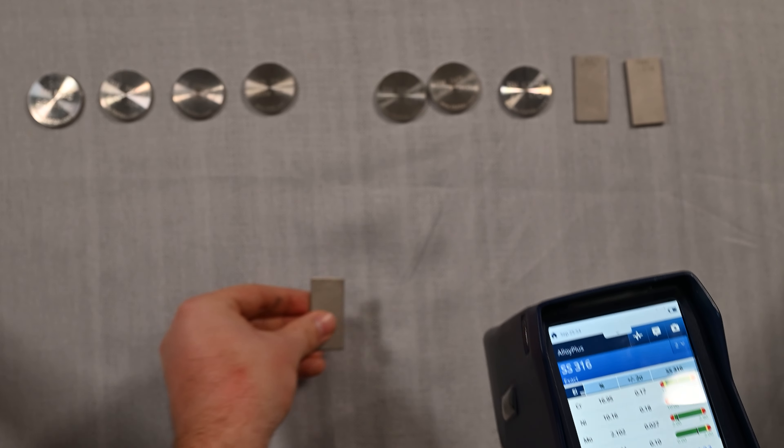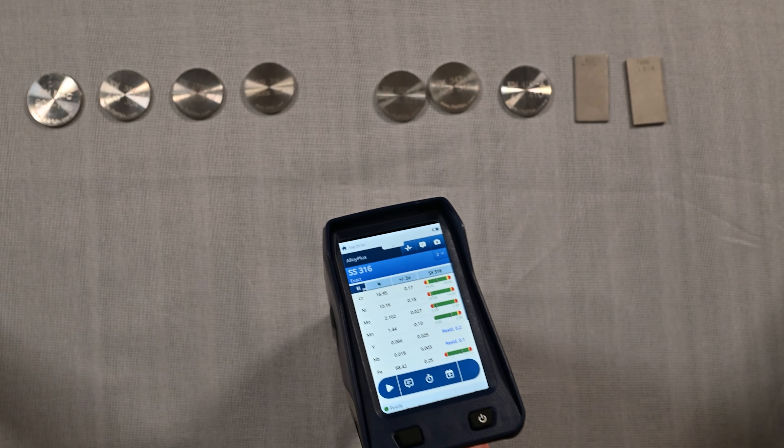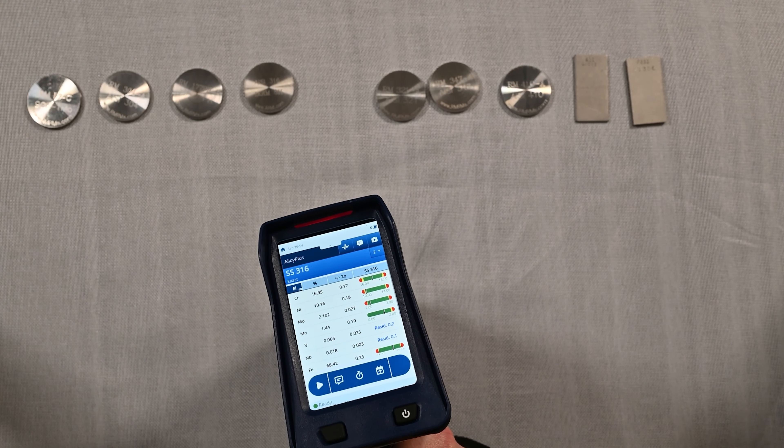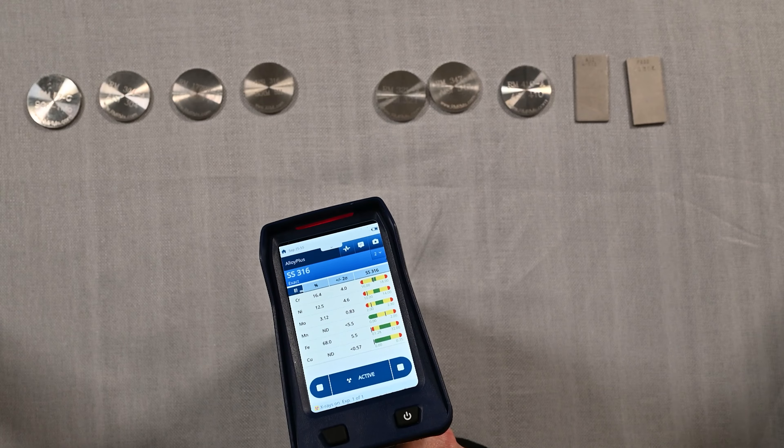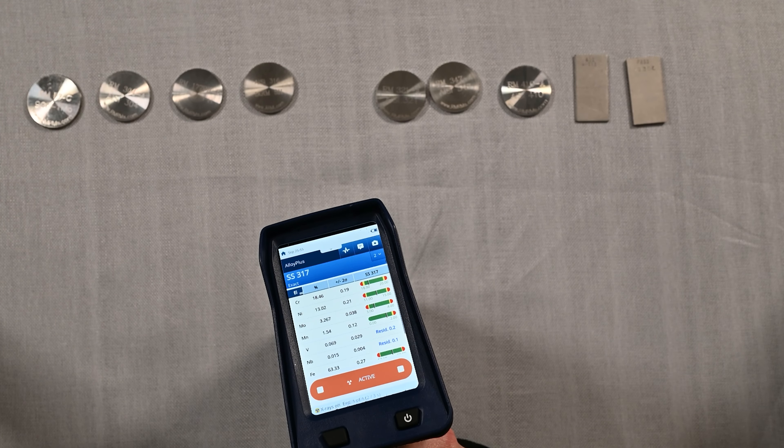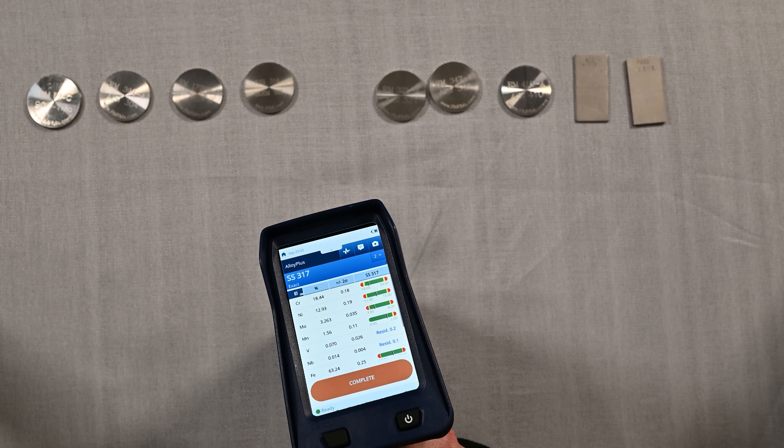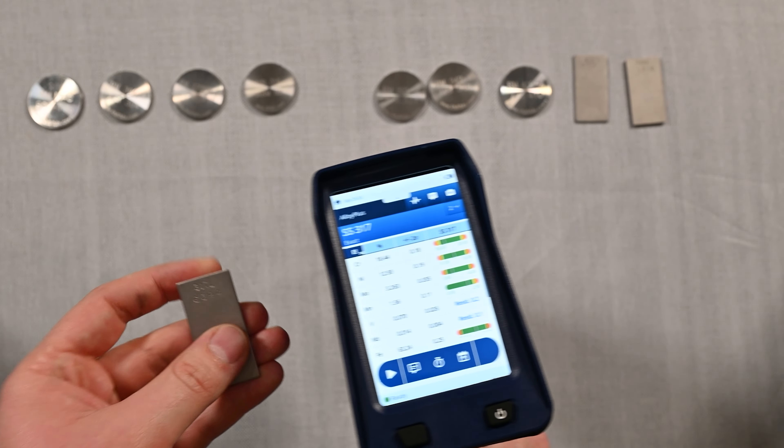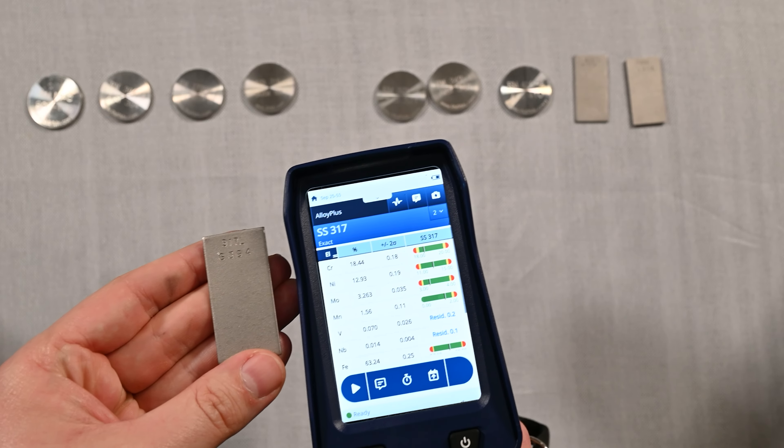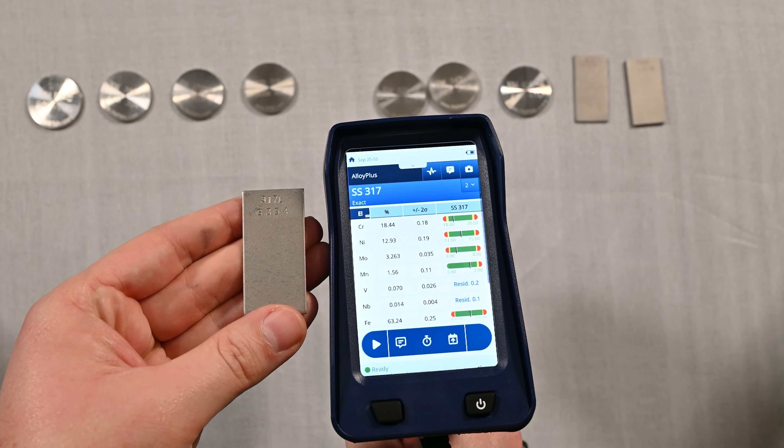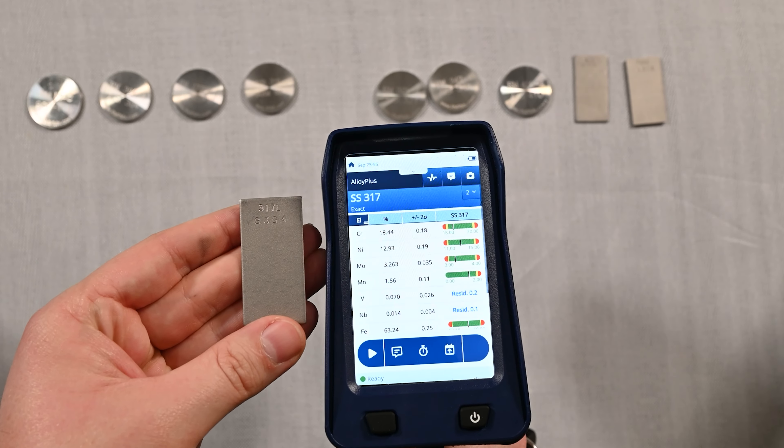Next up we're going higher in alloy content. This is 317 stainless steel, so 317 is going to have higher alloy content yet. But again, it's just a couple of seconds and you're able to identify the exact grade match with the Vanta Core and it's not a problem.